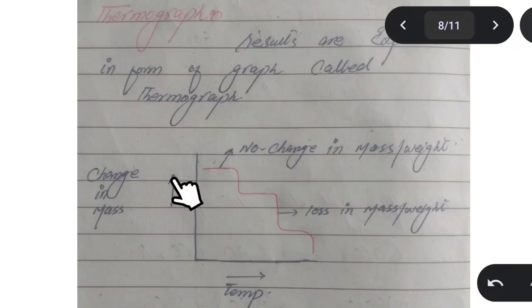Always in thermogravimetric analysis there is a change or decrease in the mass of a substance. Got it? So here is a step-like arrangement in the graph. The horizontal portion of the stair tells us there is no change in the mass, and the vertical portion tells us the loss of mass.